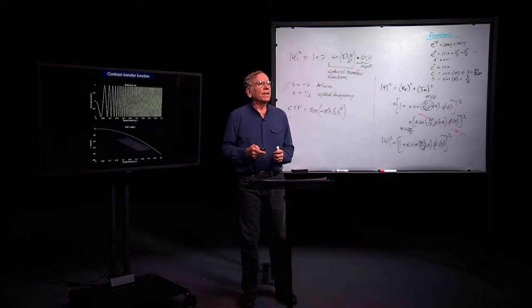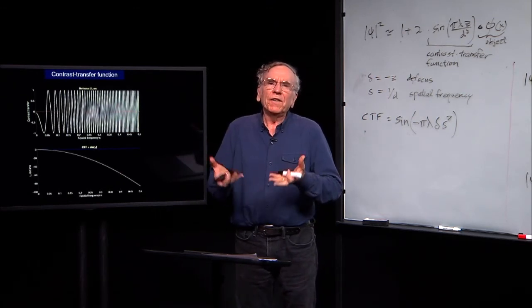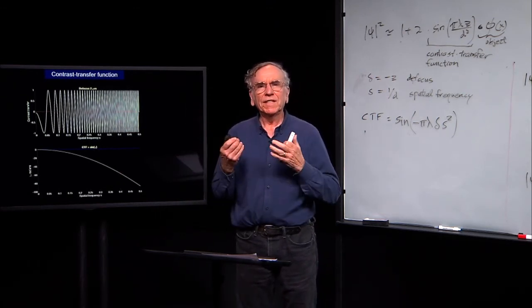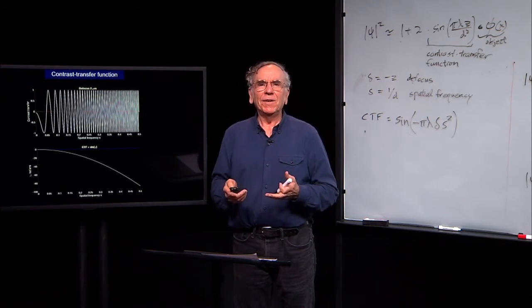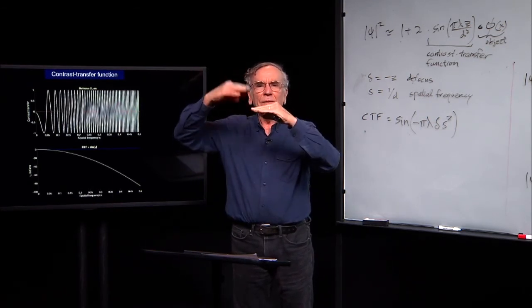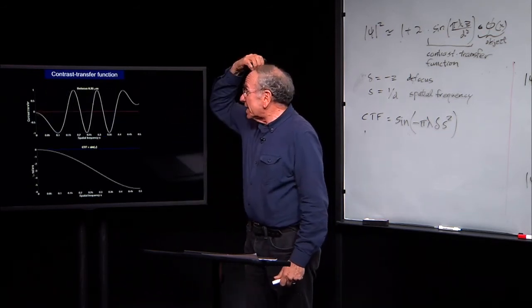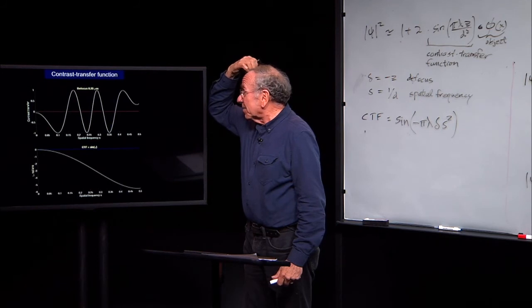Now, at this point, we can ask the question, well, why focus above the specimen? First, it doesn't make a lot of intuitive sense. And second, it should give us just the same contrast as focusing below the specimen. Well, there are two reasons that make it interesting.